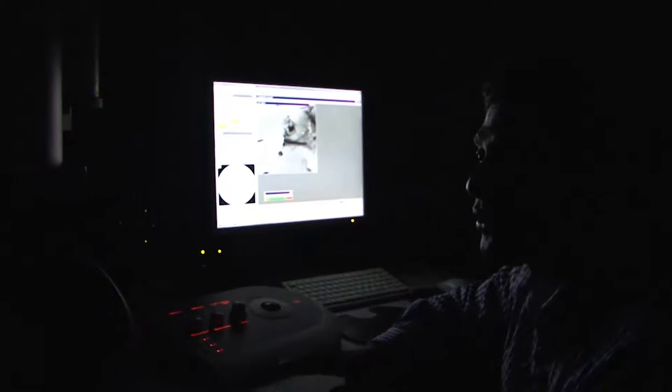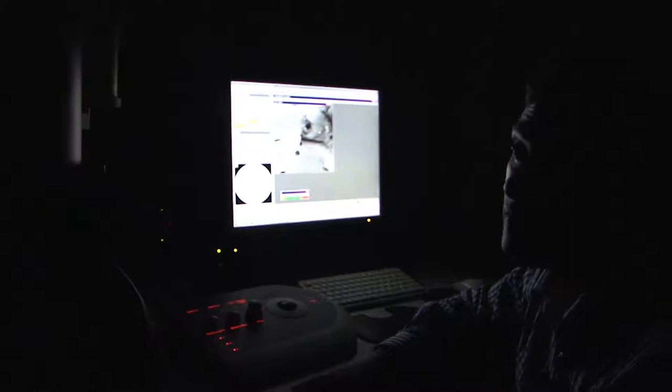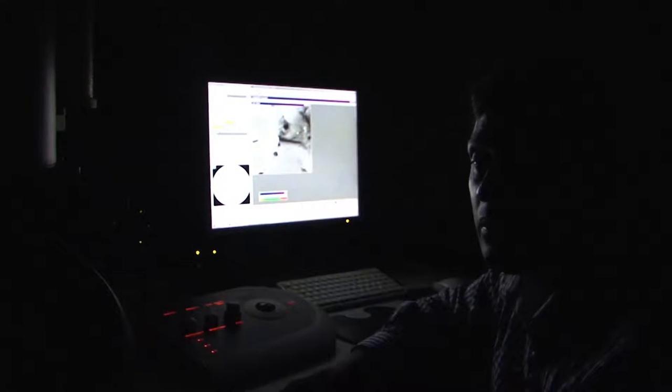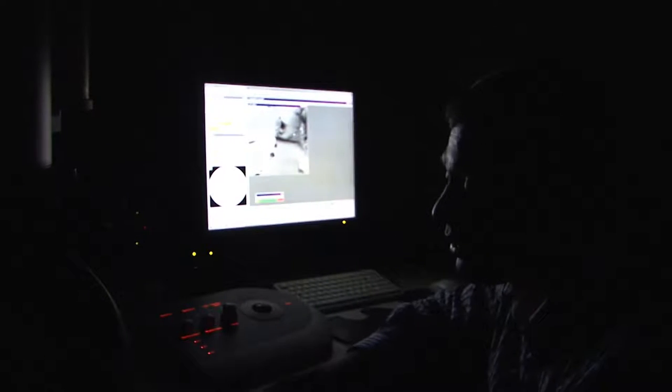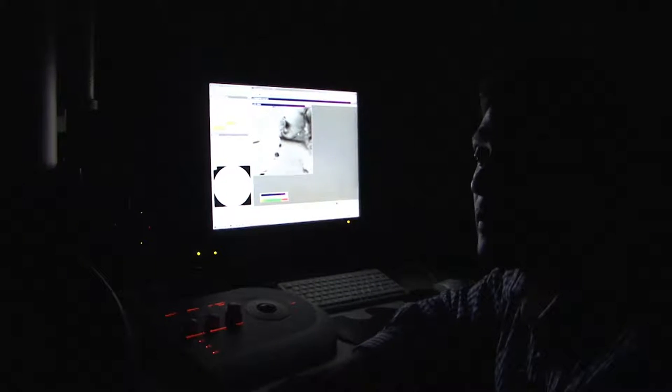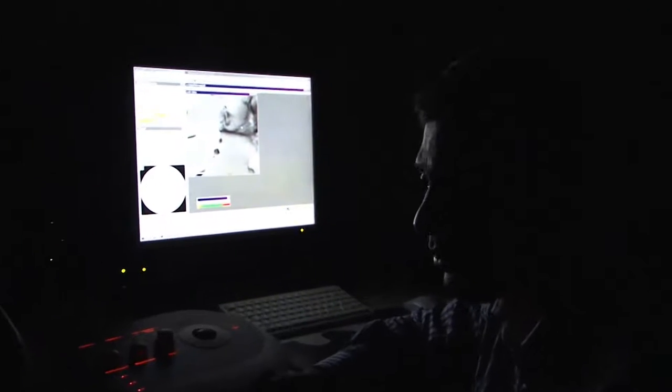The most important thing in a microscope when somebody sits is the diffraction pattern, because the diffraction pattern is basically formed by the diffraction of the crystals in the sample as the electron falls on it. Electrons getting diffracted lead to this kind of diffraction pattern, and it contains all information regarding the sample type, the features within the sample, whether there are defects or not, and depending on the orientation of the crystals, this diffraction can change. That's why the diffraction pattern is known as the most important thing in a transmission electron microscope.